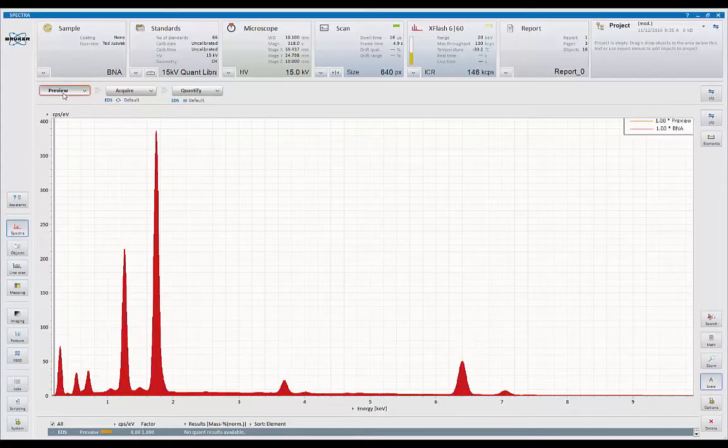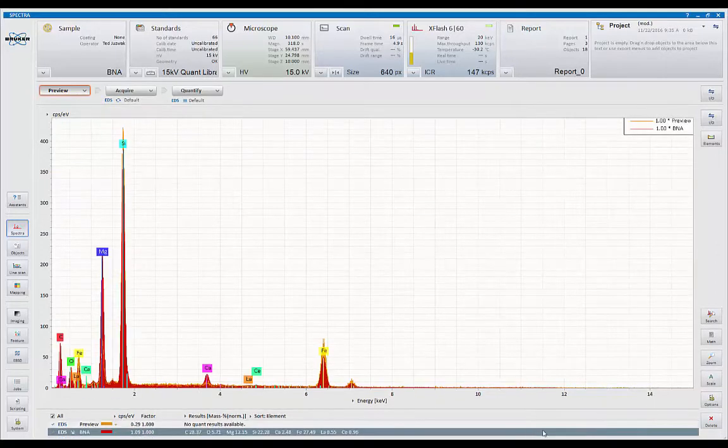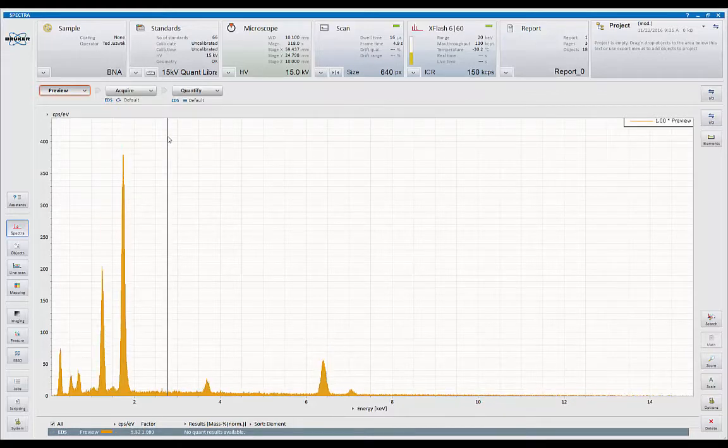Preview is just that. It's an older technique that we've used for years. I'm going to clear off the original spectrum here simply by hitting X. So now we're doing a very rapid scan. So the way this thing is set up, remember, any place we see a down arrow key brings a menu. We're currently telling the system to start a new spectral acquisition every 400 milliseconds. So what this allows me to do is I can scan the sample.